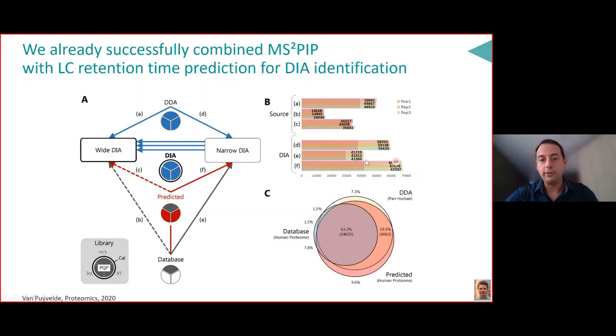So these are the results that you can see in F here at the bottom, where we actually outperform any other system. So E is a system that, as you can see on this plot, is just going from the database and then calibrating based on that, which is a really bad system, so it's got very poor results.